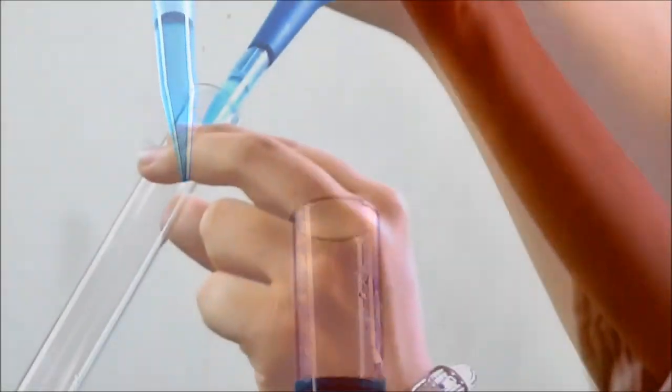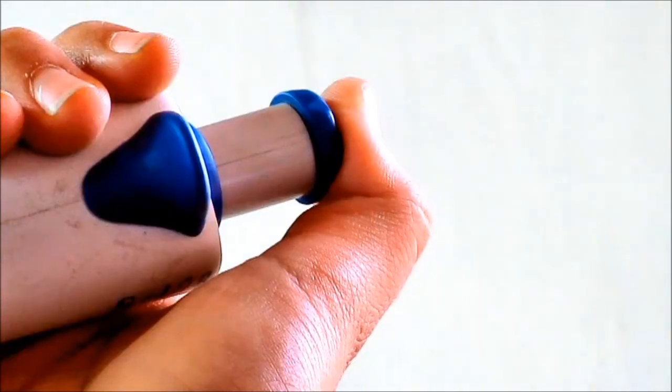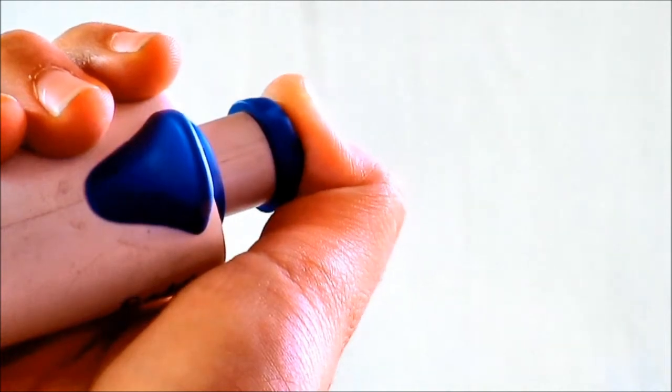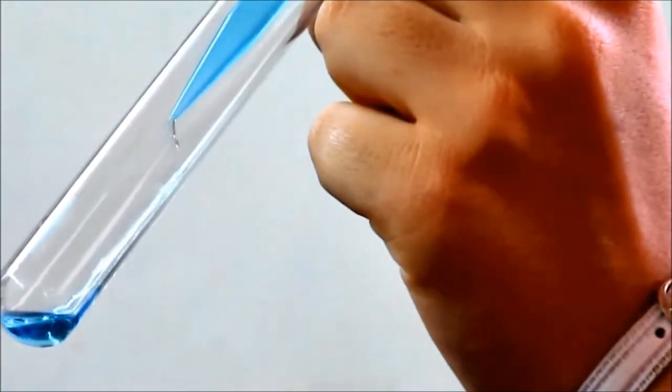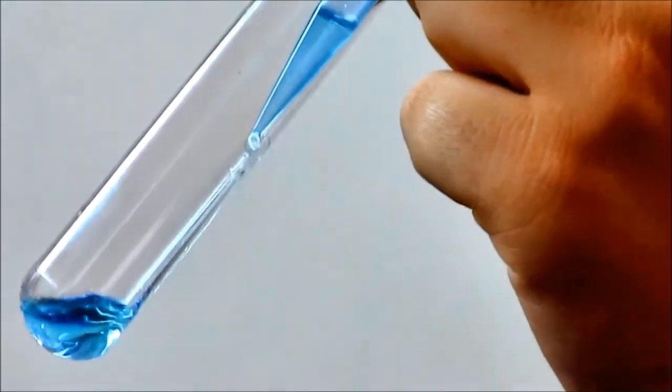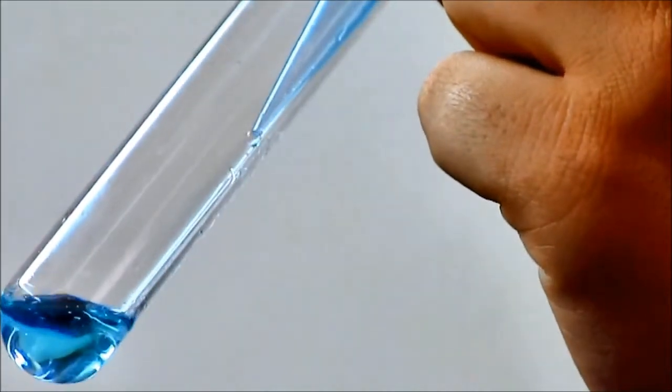The sample is then unloaded by pressing the volume adjustment knob. Once the whole liquid has been ejected out, the volume adjustment knob is released.